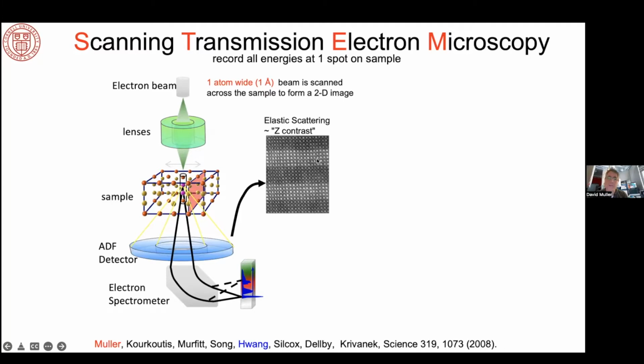So that would be the typical imaging mode you would get in a microscope, and this would show up on your screen at maybe TV rate. On a modern instrument, this image is a TV rate kind of image.